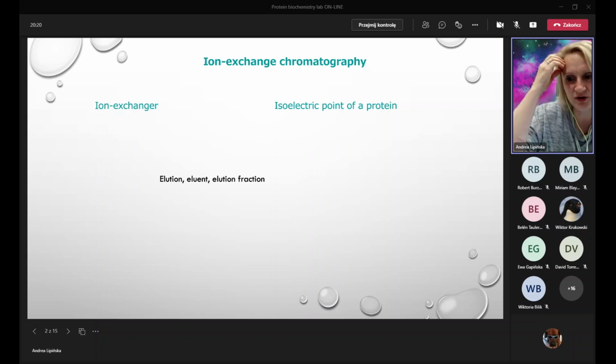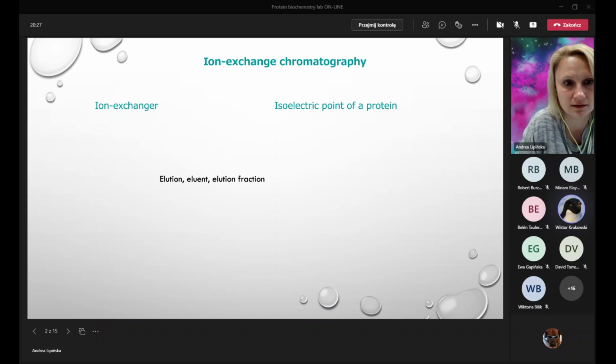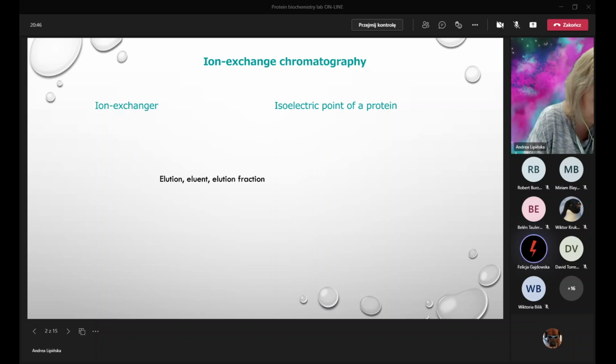And what about the UV-based spectrophotometry? I think it was meant for the next lesson, or I don't really see it. Okay, so maybe you skipped that part. Yeah, I think I skipped it. You skipped it. So group 6 did not skip that part. So what's the concentration of lysozyme from group 6? I think it was around 0.9 milligrams per milliliter. Yeah, right. So this is our concentration, and this is after concentrating the lysozyme.